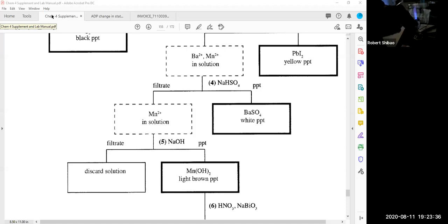We aren't quenching. If I quench this in water and rapidly cool it, then it's not going to get the optimum lowest energy bond angle. So what I have the students do is just a quick anneal. Anneal all the bottoms of the test tubes so that we don't punch holes into them.